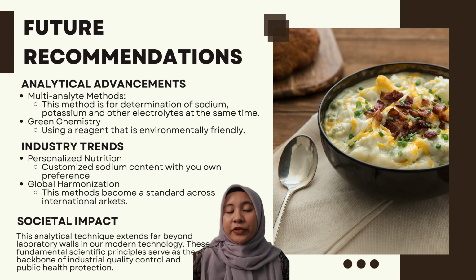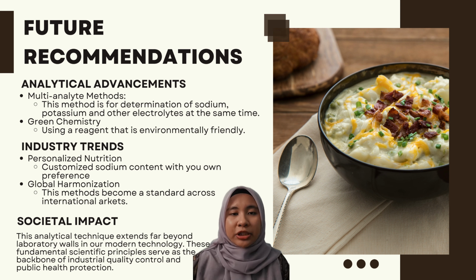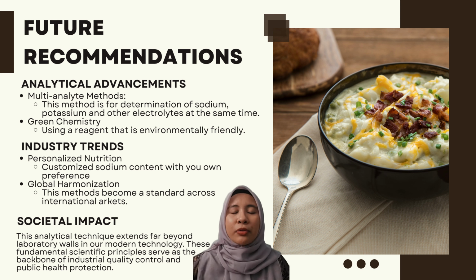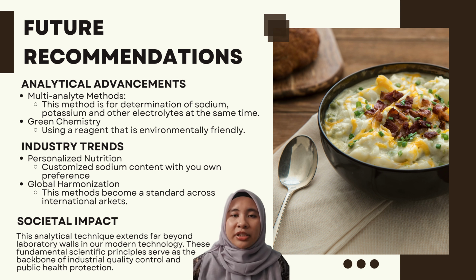Next is for the future recommendation. There are a lot of future recommendations that we would like to share with you, but unfortunately for today we can only share three of them. For the first one is the analytical advancement, like multi-analyte methods, which is the determination of sodium, potassium, and other electrolytes at the same time. And another one is the green chemistry, where we use environmentally friendly reagents.